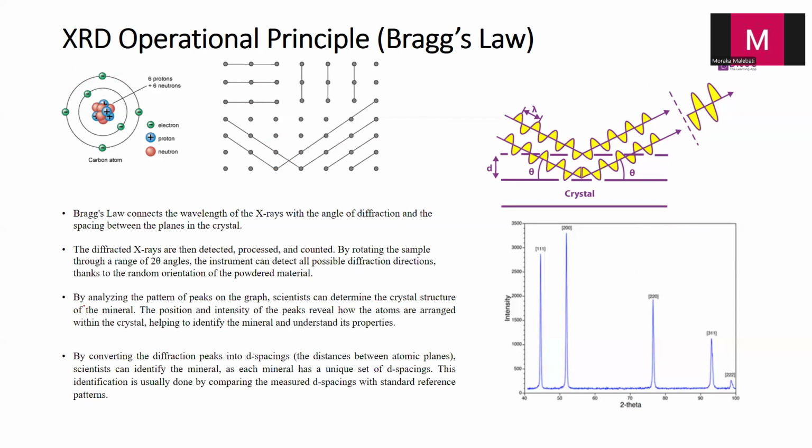By analyzing the pattern of peaks on the graph, scientists can determine the crystal structure of the mineral, the position, and the intensity of peaks.